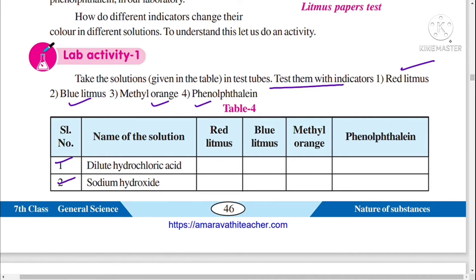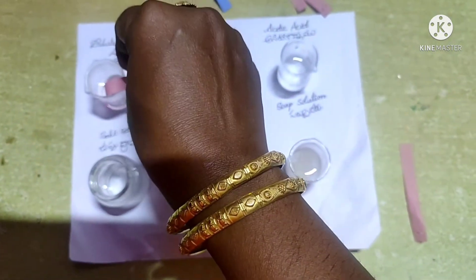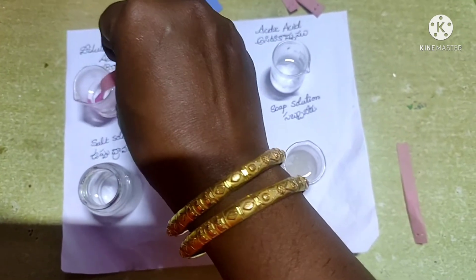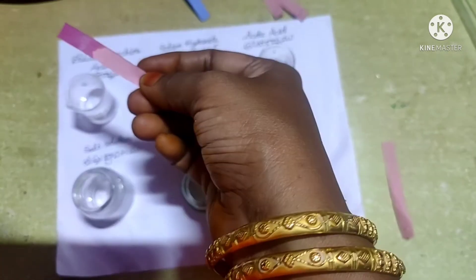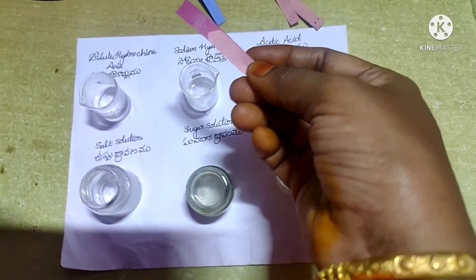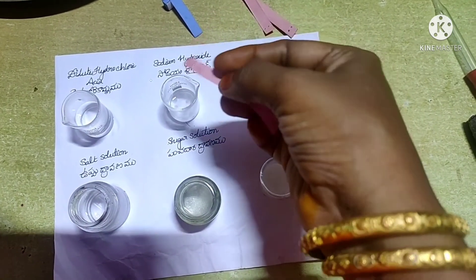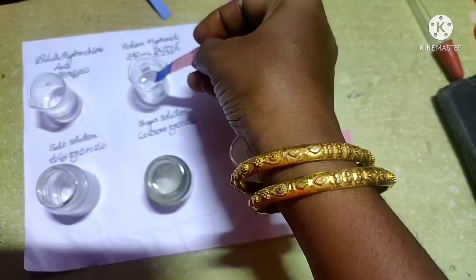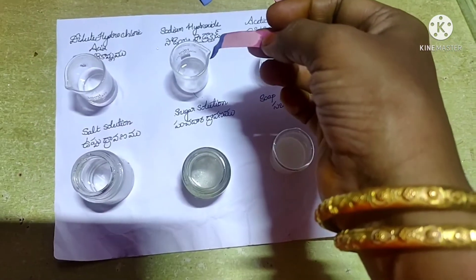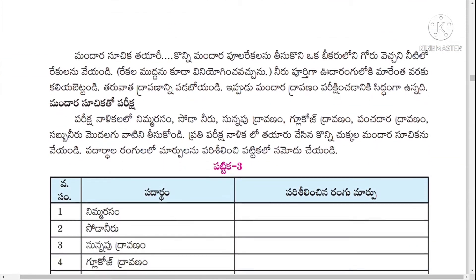First of all, we will conduct the activity with the red litmus paper. Take a red litmus paper and dip it in the dilute hydrochloric acid and observe the color — there is no change. Then take red litmus paper and insert it into the sodium hydroxide solution; it will turn blue. If the red litmus paper changes to blue color, it indicates that the given solution is a base solution.